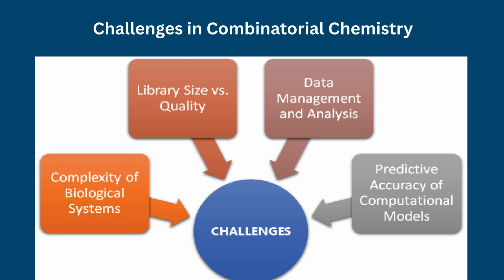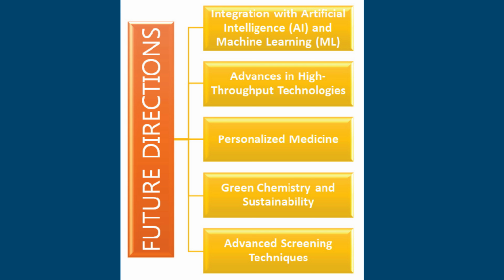Despite its advantages, combinatorial chemistry presents certain challenges. The efficiency of synthesis can be affected by factors such as molecular size, solubility, and functional group compatibility. The generation of racemic mixtures and the complexity of purification and identification in mixture-based libraries can also limit effectiveness. Nonetheless, ongoing technological advancements continue to address these limitations. Recent developments have significantly expanded the capabilities of combinatorial chemistry.